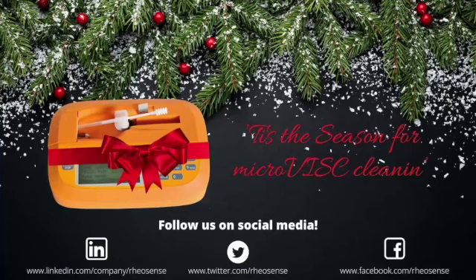That brings me into our next topic, which is choosing the right chip for your application. Essentially, there's no one size fits all chip or shear rate or testing measurements. It's all going to be dependent on what you want to test, what parameters you're looking for, and what you're hoping to accomplish with your testing. A couple of tips that we have for you is to first figure out what shear rate you want to be testing at. That will be dependent on the application of your sample.